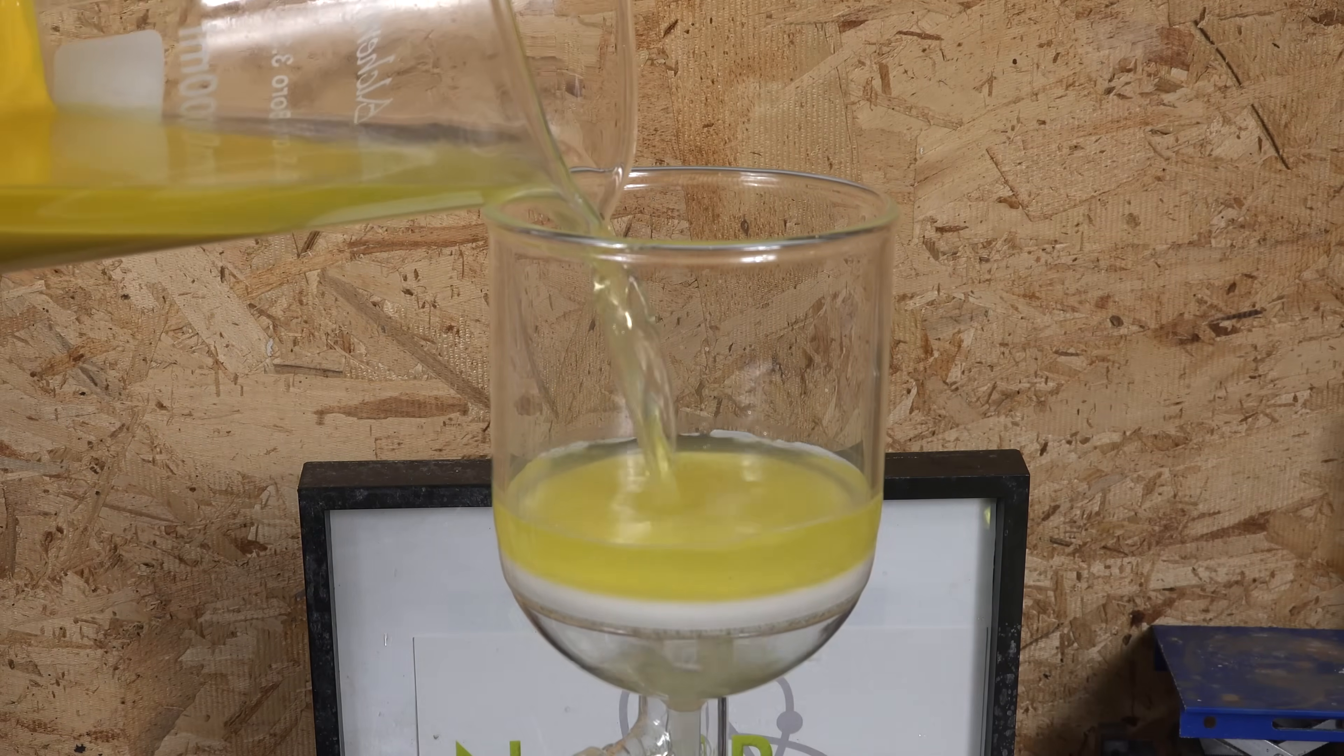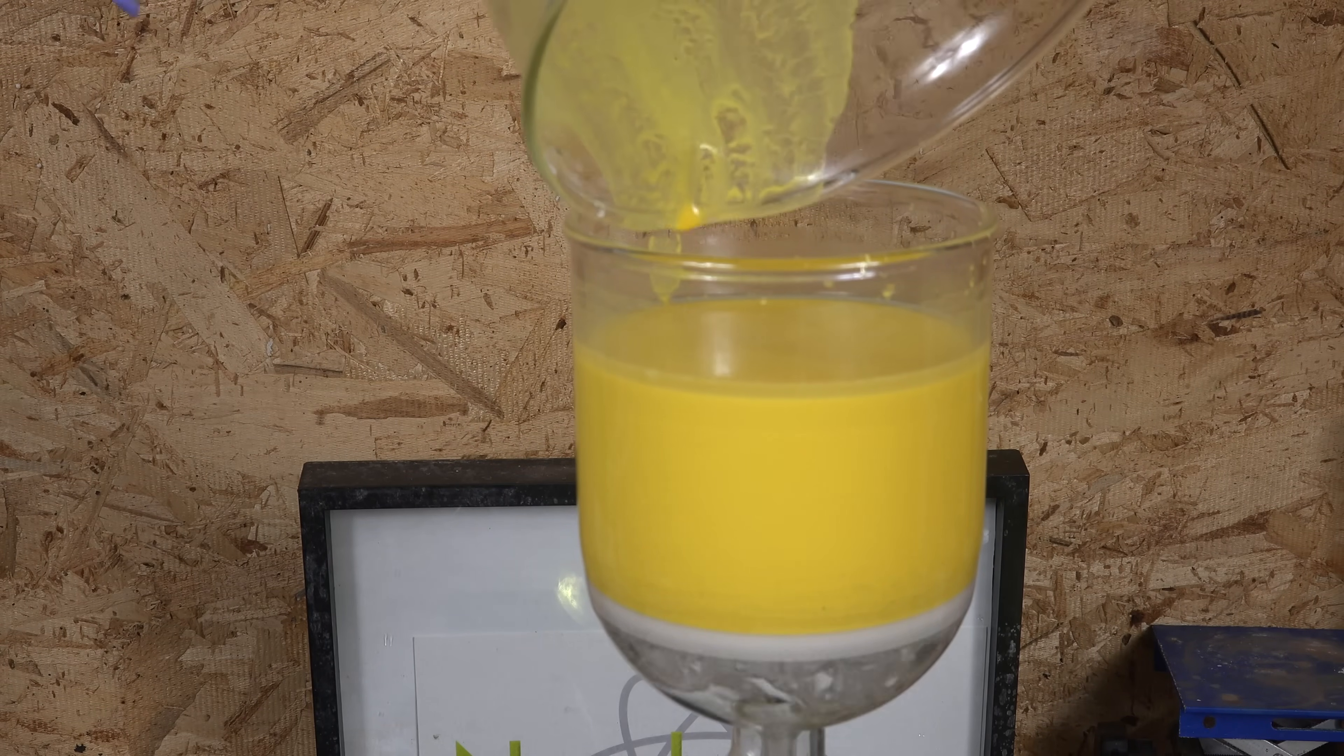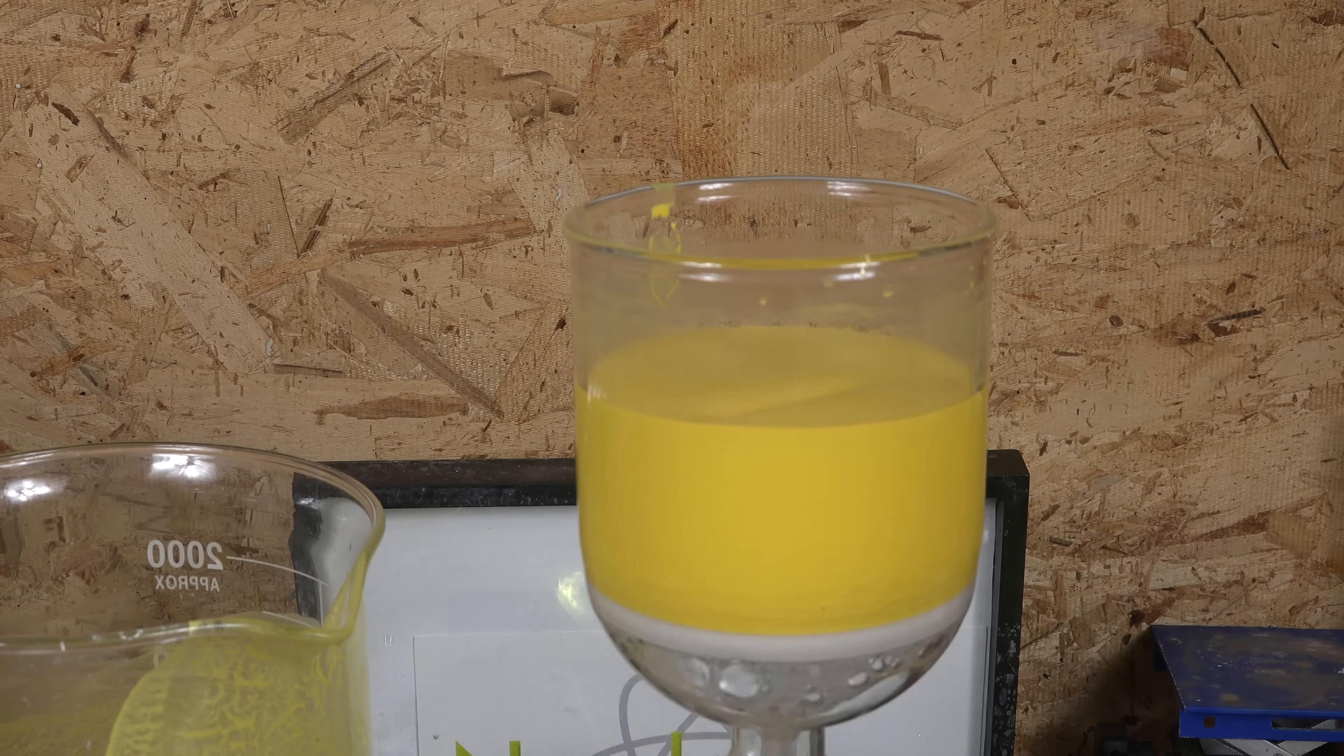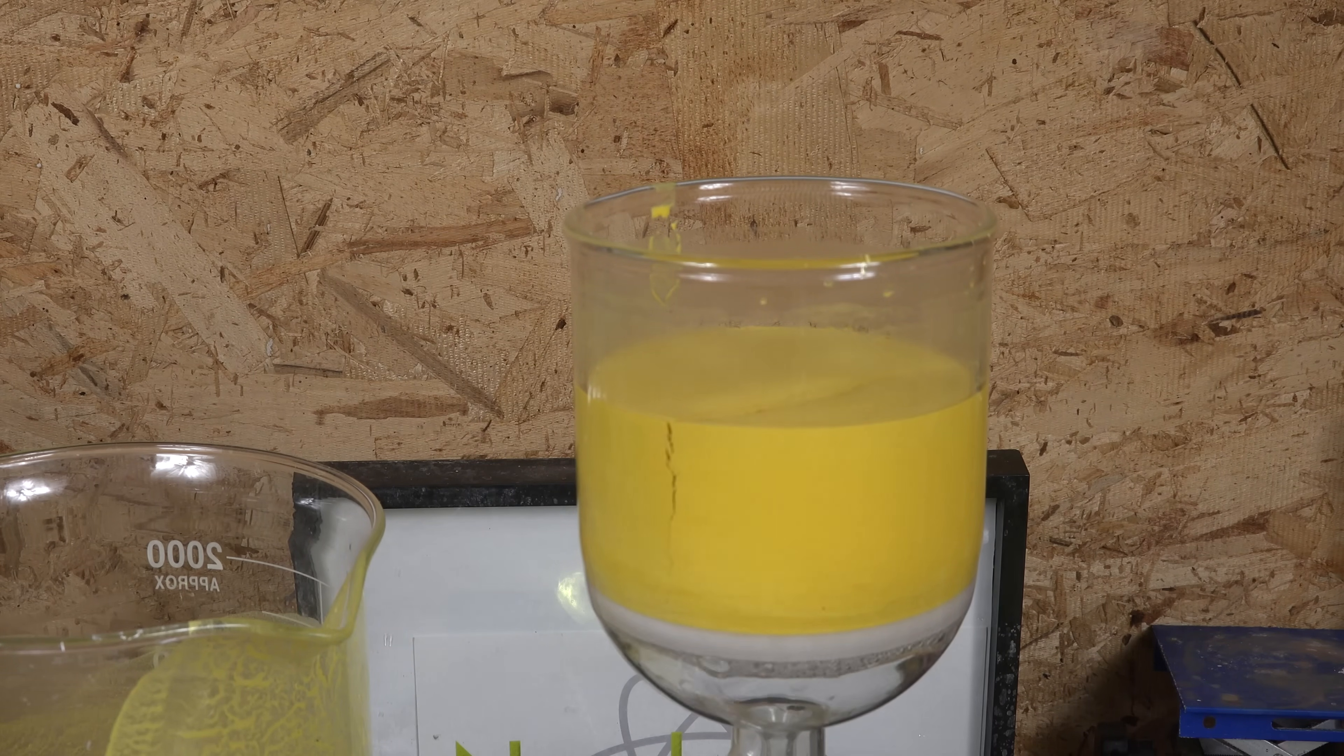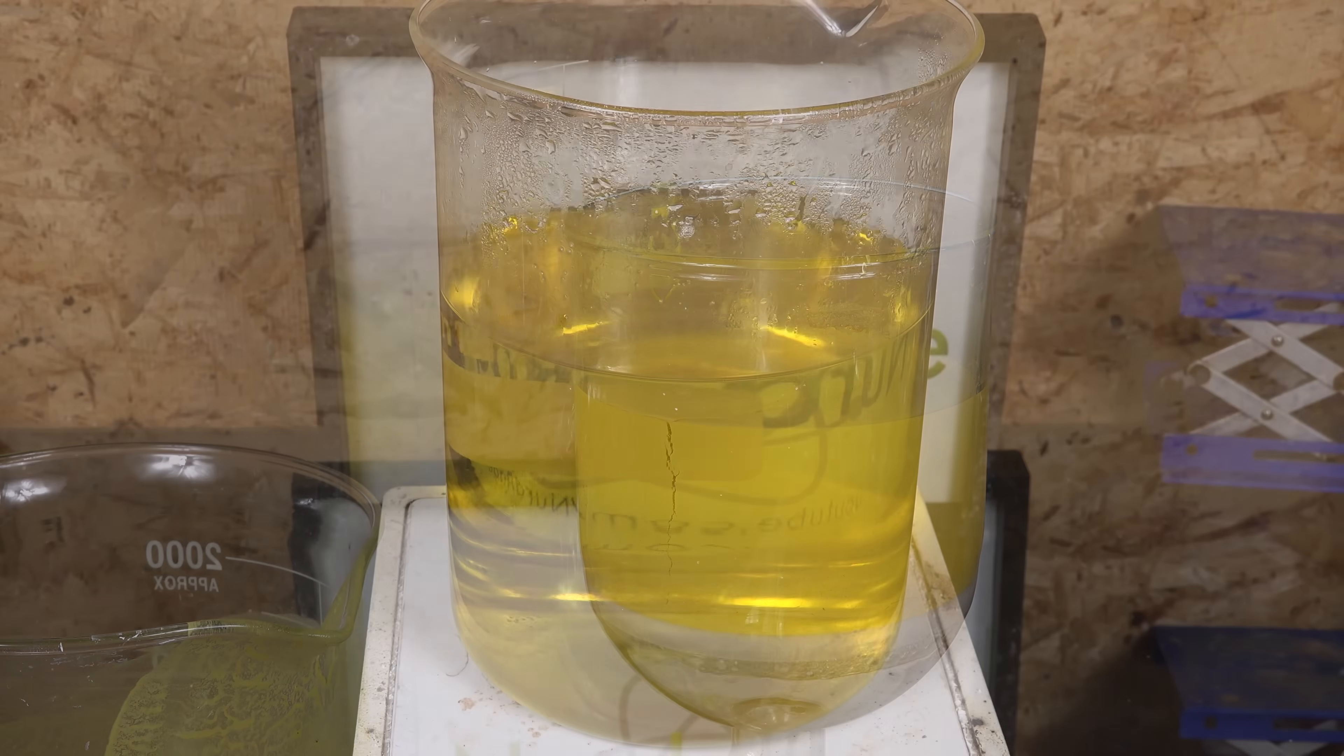I find it much easier to decant and filter rather than filtering these slurry directly. The residue is iron oxalate and is useful in itself for making such interesting compounds like pyrophoric iron. So you can save it if you want, although it is very impure containing lots of unreacted oxalic acid, so keep that in mind.